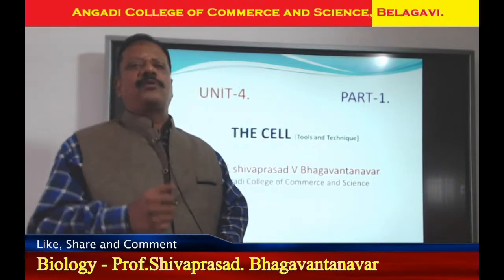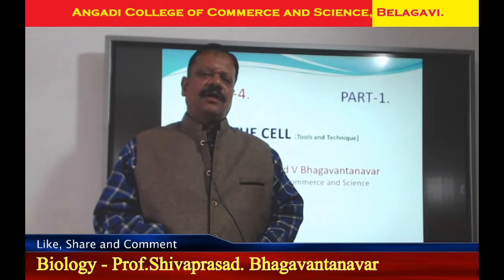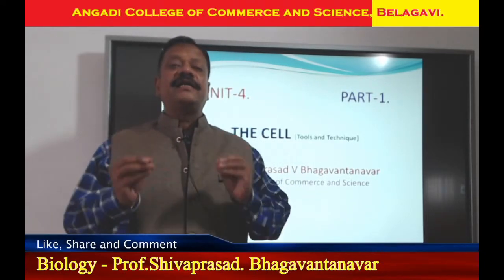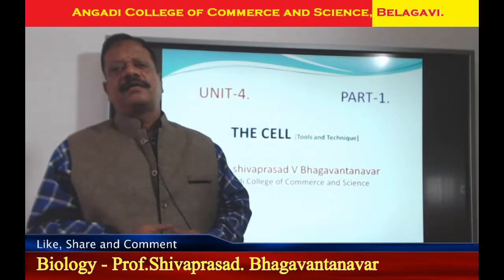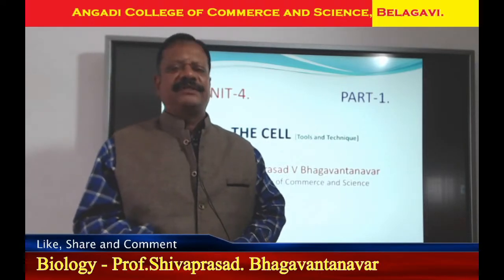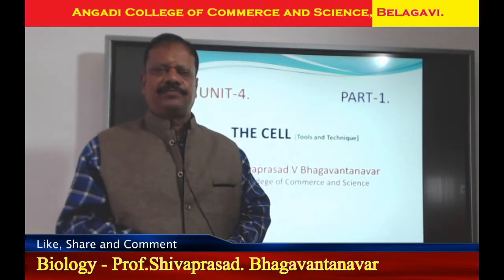Those things we observe under the simple microscope. And the things which are not clearly seen by the naked eyes, those materials we observe under the compound microscope. In the laboratory you might be seeing simple as well as compound microscopes.